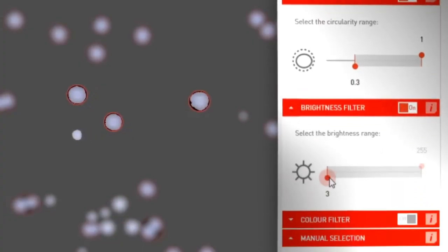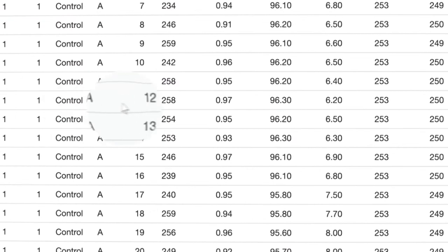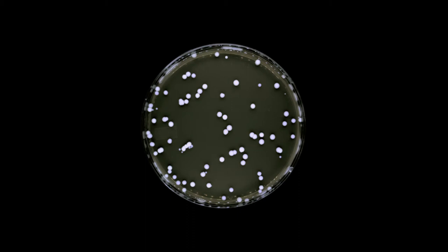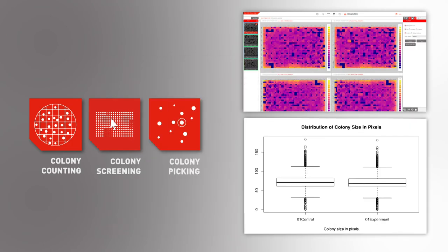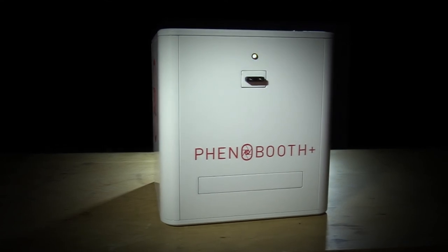Comprehensive phenotyping, traceable results, multiple lighting options, advanced applications. Phenobooth Plus — it's just a colony counter.